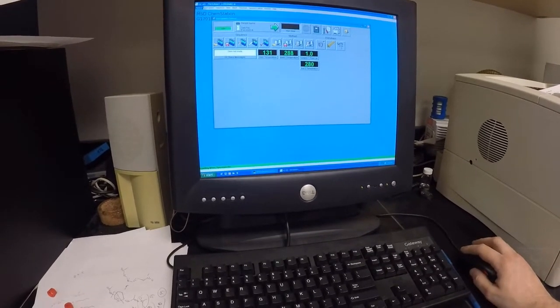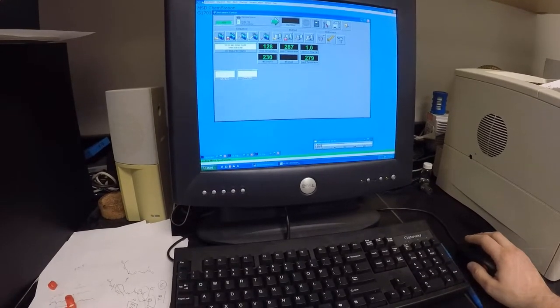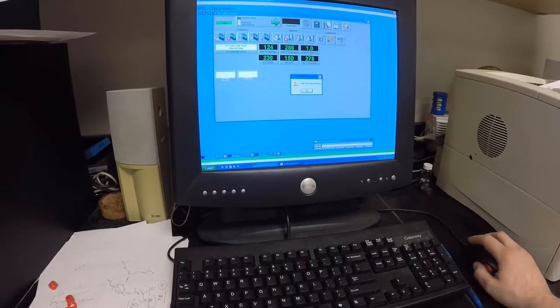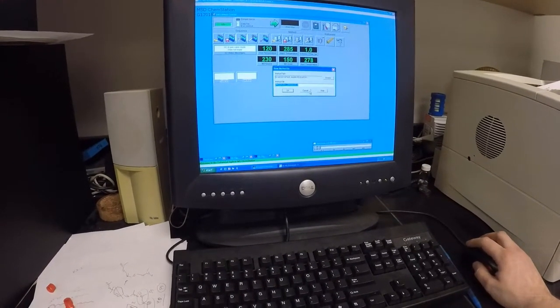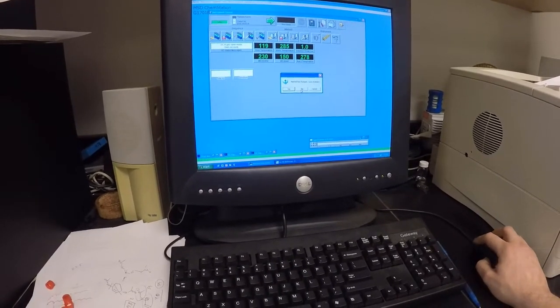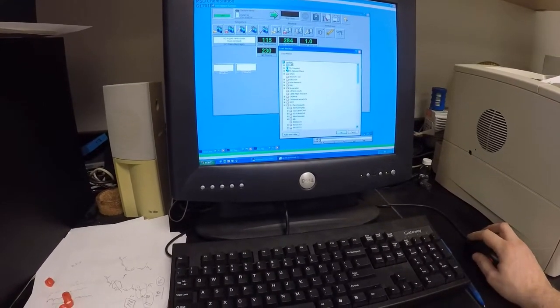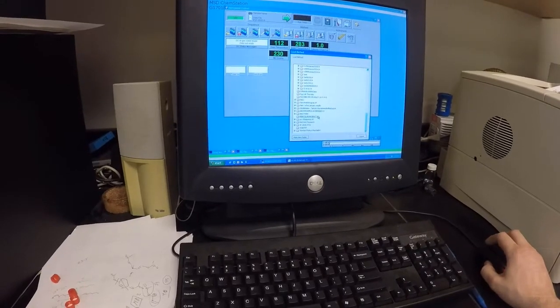So I'm going to go to method as soon as it comes up. Any little errors there come up, go ahead and click them. I want to load a method, and I want to go onto the desktop. We should have, maybe at the bottom down here, a CHEM 408.